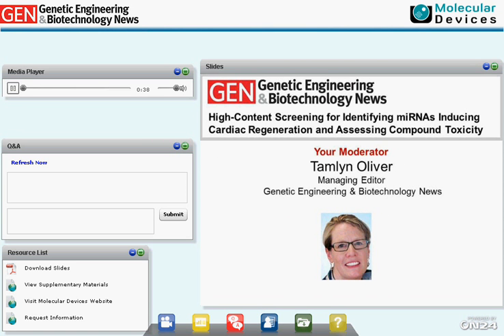The three speakers in this webinar will discuss how high-content screening can be used to assess microRNA-induced neonatal cardiomyocyte proliferation in vitro, how it can be applied to evaluate restorative properties of microRNA after myocardial infarction in vivo, and also how it can be applied to cardiac safety testing of pharmacologic compounds.